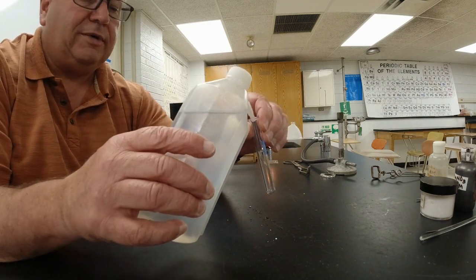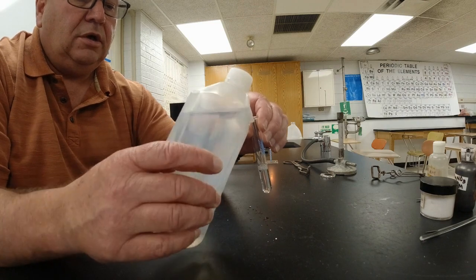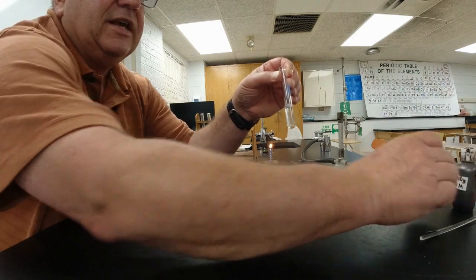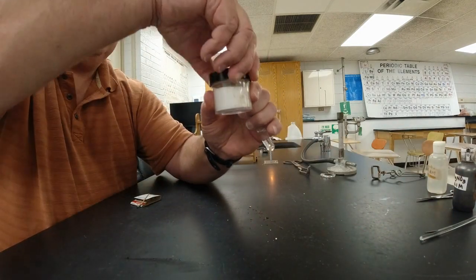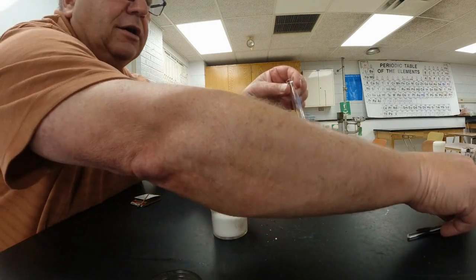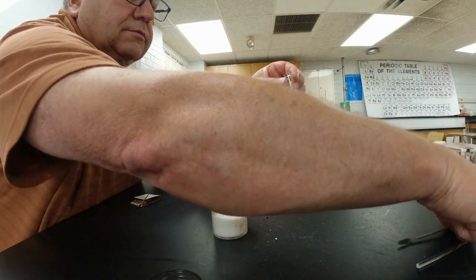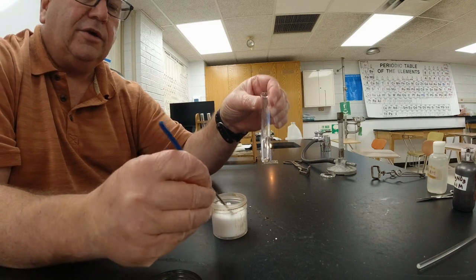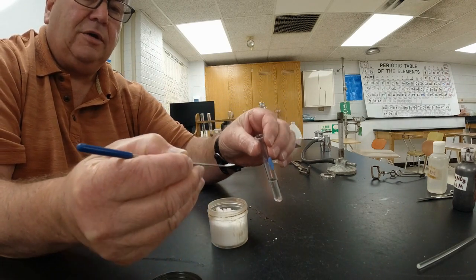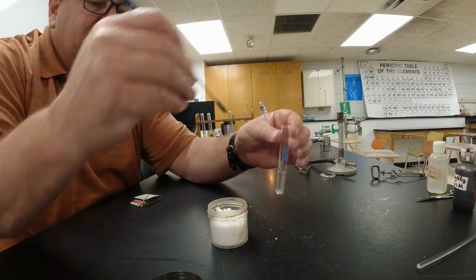All right, if you're sensitive to chlorine, tap water could be a problem for some people. So I'm going to squirt about an inch of distilled water into the test tube, and then it says to add a little bit of sodium chloride. Now, sodium chloride is just commonly called table salt. All right, so here I'm going to take this white crystalline powder that's in here, and I'm going to put a little bit of it into the test tube.